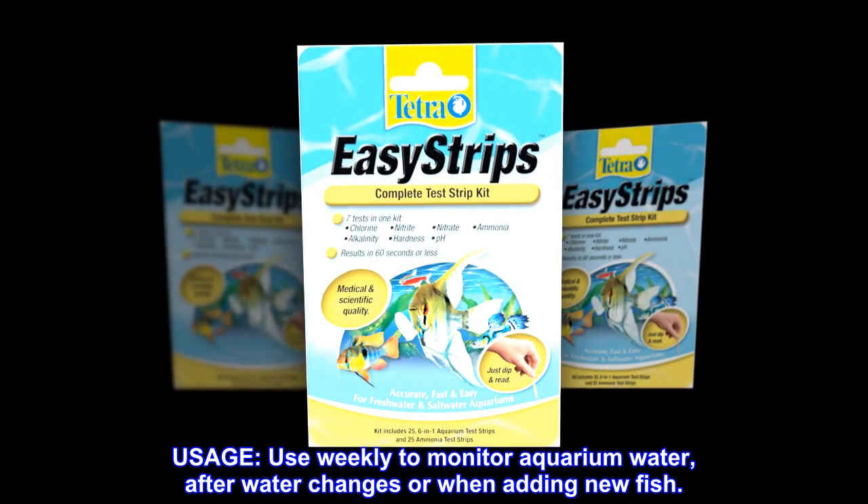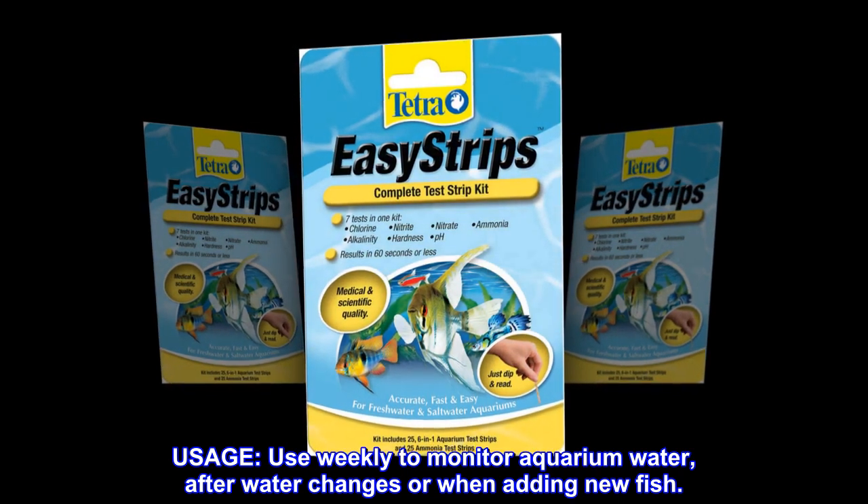Usage. Use weekly to monitor aquarium water, after water changes or when adding new fish.